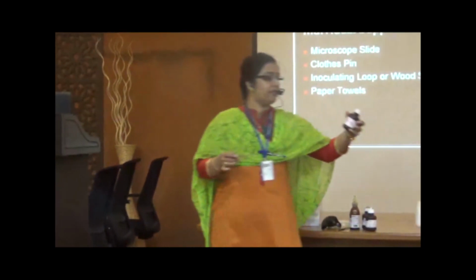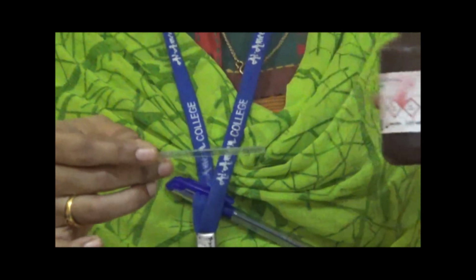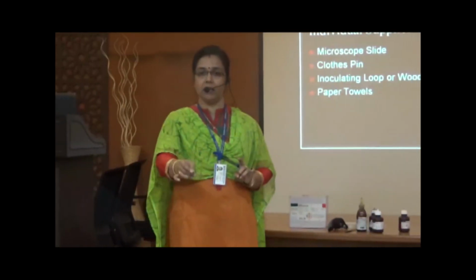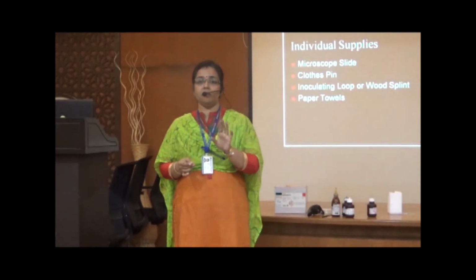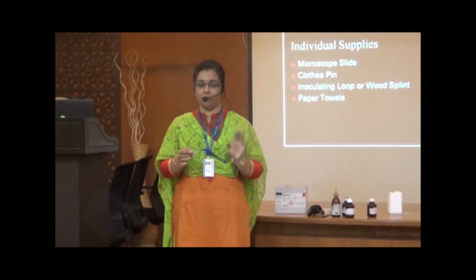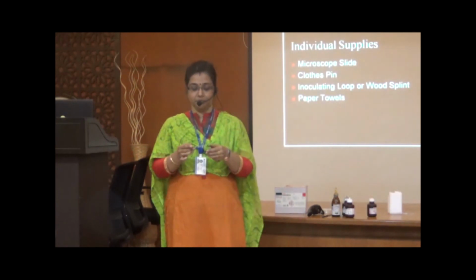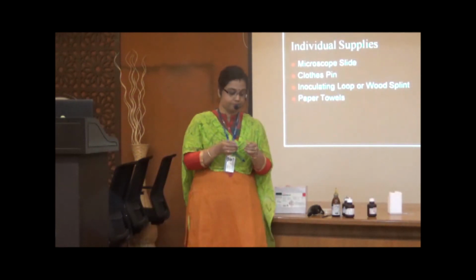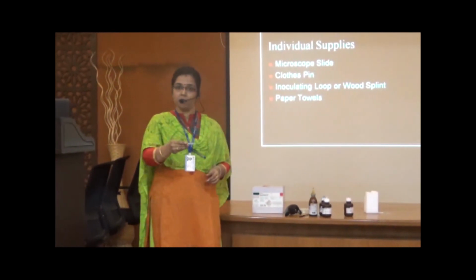Then take the secondary stain, safranin, for the staining process again. Add 2 or 3 drops of safranin to the slide. Wait for 1 minute and then wash out the slide. After all this, we need only 4 or 5 minutes to complete this process. After this, we allow the slide to air dry. After air drying, we can observe this slide under the microscope.